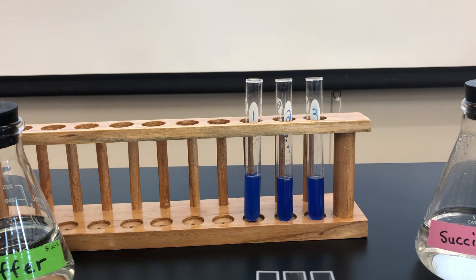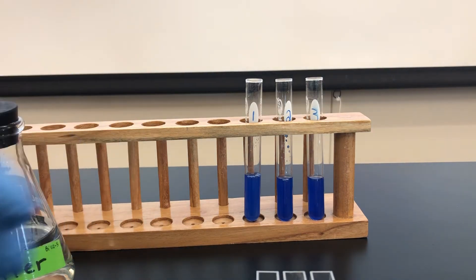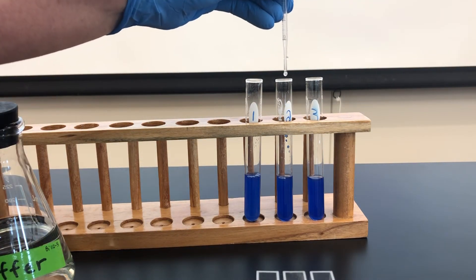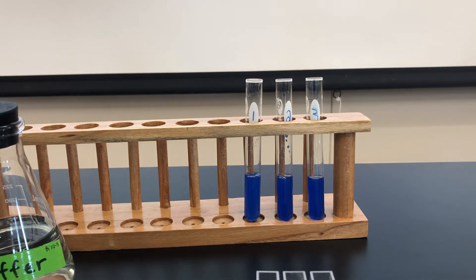Lastly, we'll add our succinate. Succinate will not be added in tube 1, but we'll have it in tubes 2 and 3. In tube 2, we're looking to add 0.2 mils, and in tube 3, 0.4 mils.